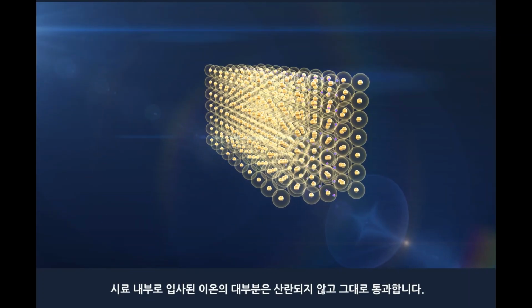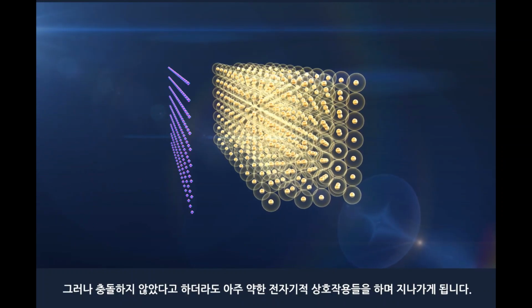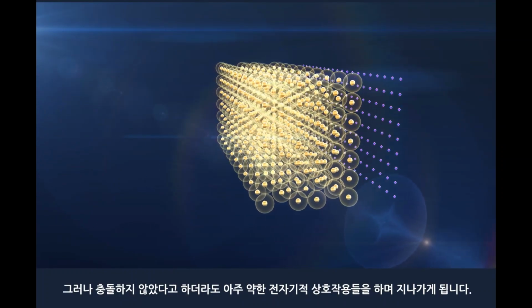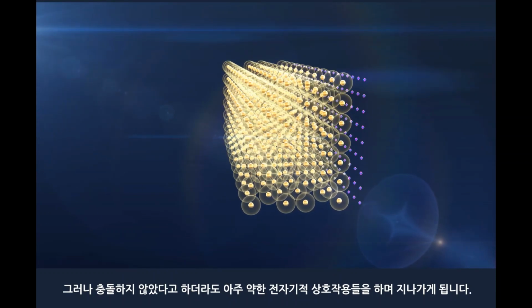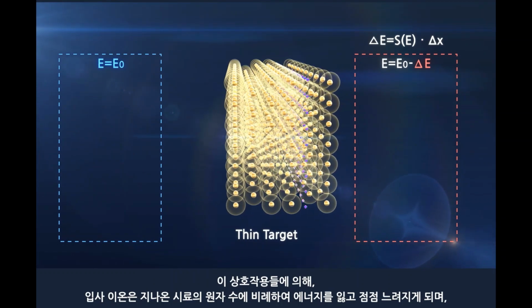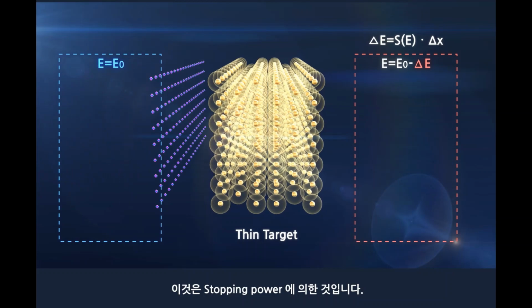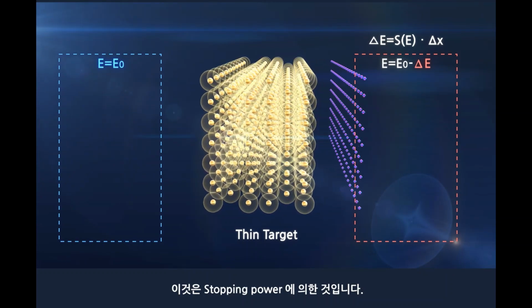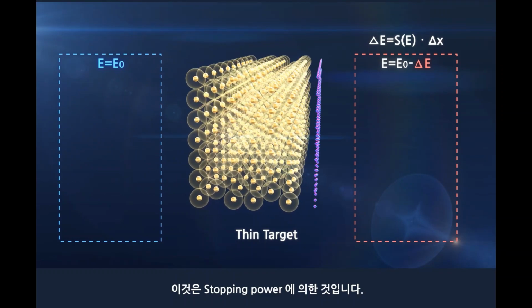Most ions that are incident on the sample pass through without scattering. However, even if they did not collide, they pass through the medium with very weak electromagnetic interactions. Owing to these interactions, the incident ions lose energy and gradually become slower. The incident ions slow down in proportion to the number of atoms in the sample passed. This is called the stopping power.